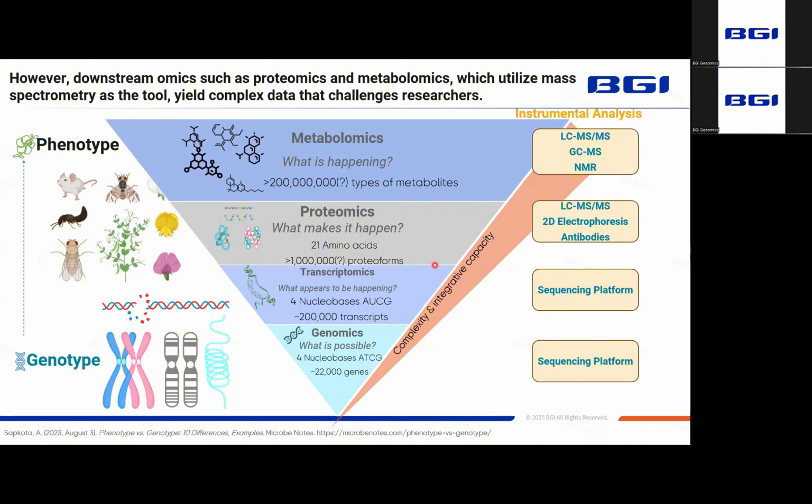For example, in a typical mass spectrometry ion chromatogram, each peak represents one or more similar substances, and only by referencing the specific instrument's database can further analysis be performed. The entire process, from wet lab to data analysis, needs to be fully integrated. This complexity often causes confusion and difficulty for many researchers.